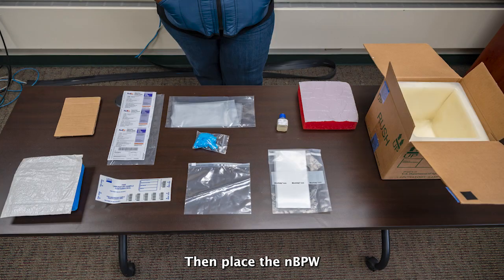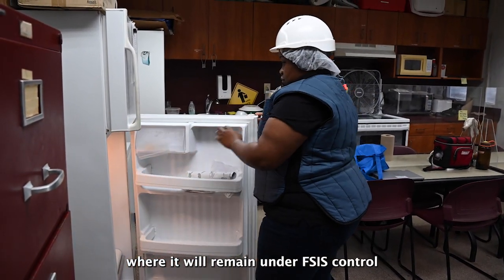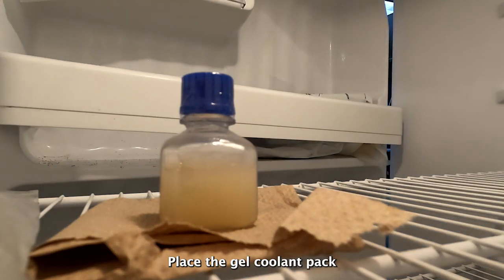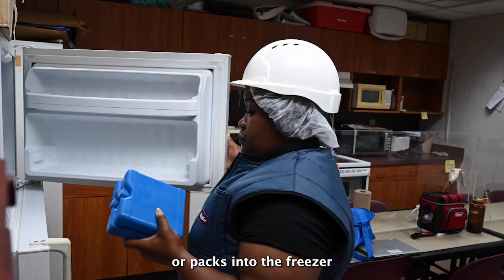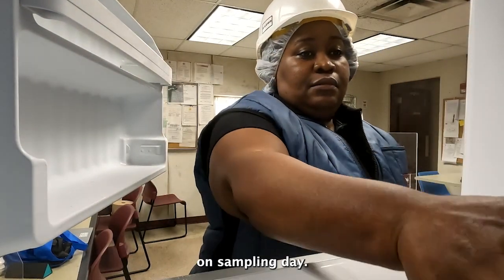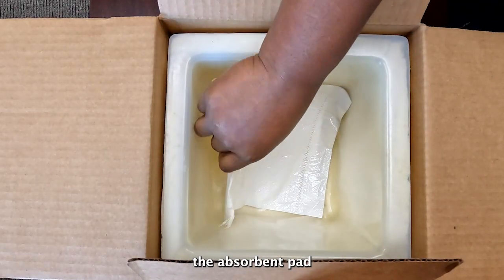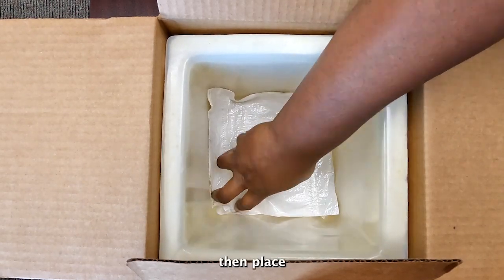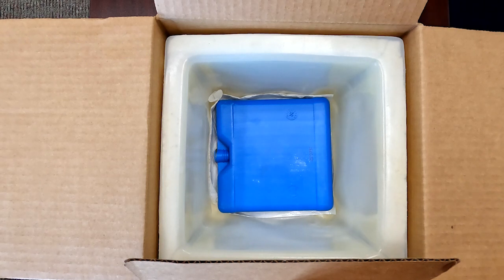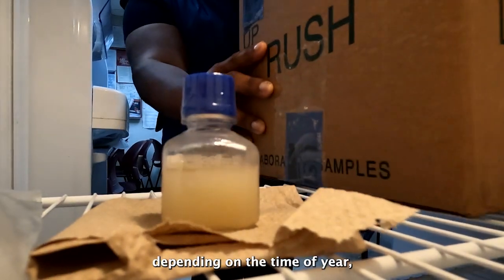Then place the NBPW in a secure refrigerator where it will remain under FSIS control. At least 24 hours before sample collection, place the gel coolant pack or packs into the freezer to ensure that they are frozen solid. On sampling day, pre-chill the sampling container by placing the absorbent pad in the shipping container to line the bottom, then place the gel packs on top of the absorbent pads. One or two gel packs may be provided in the sampling box depending on the time of year.